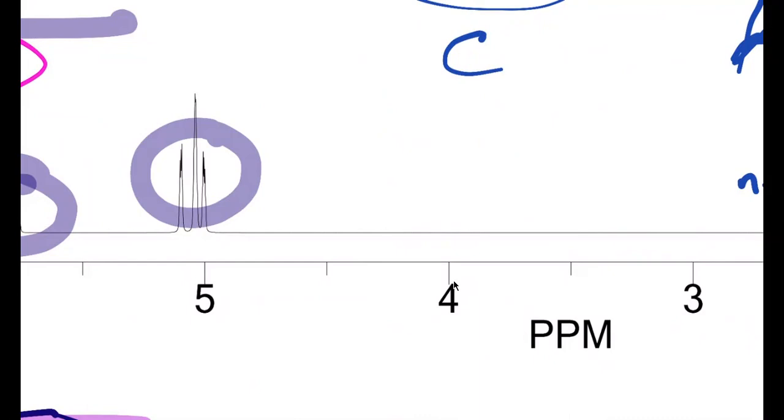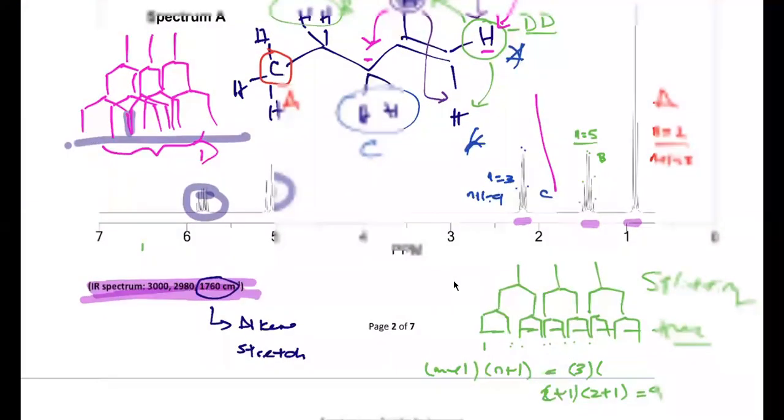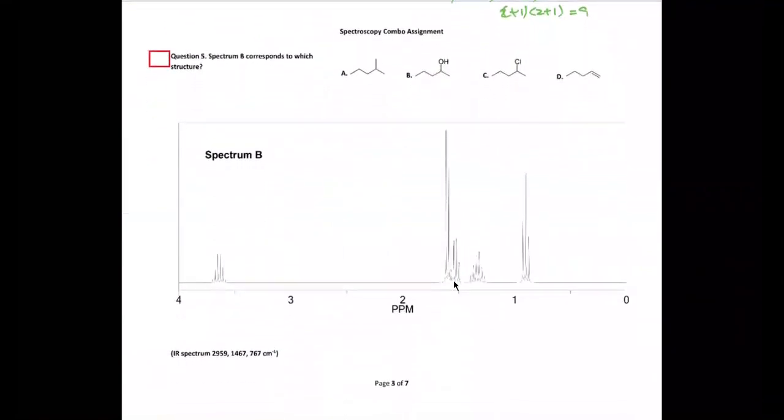Interesting, weird, but if you're an organic chemist and you're synthesizing molecules, NMR is your best friend, because it's the only way to really prove definitively that you have what you say you have. All right, let's go to the next spectrum. There's no complex splitting in that one.